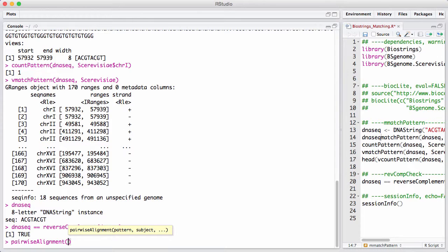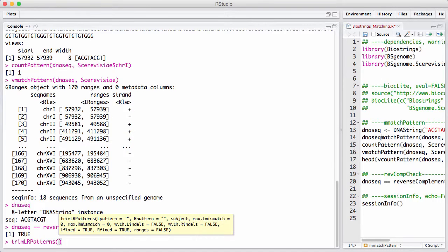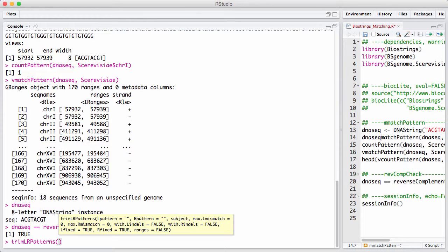Finally, there's a function called trimLRPattern for trimming of specific patterns on the left and the right of a DNA string set. The use case here is trimming off sequence adapters. But trimLRPattern has a very rich set of functionality, allowing indels and mismatches in the sequence adapters, and can be useful for this.